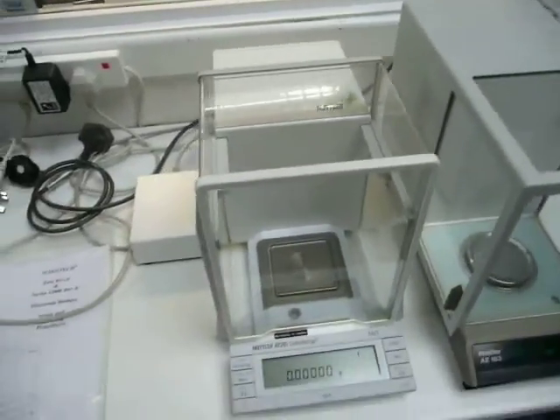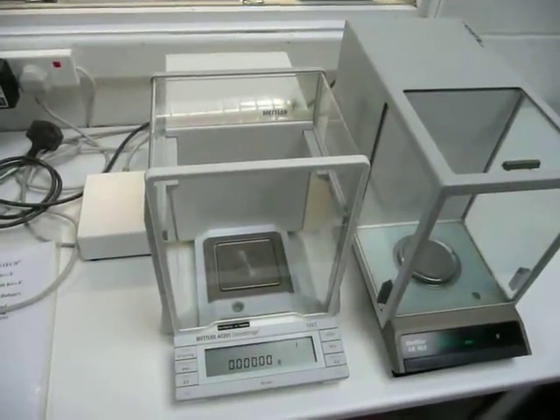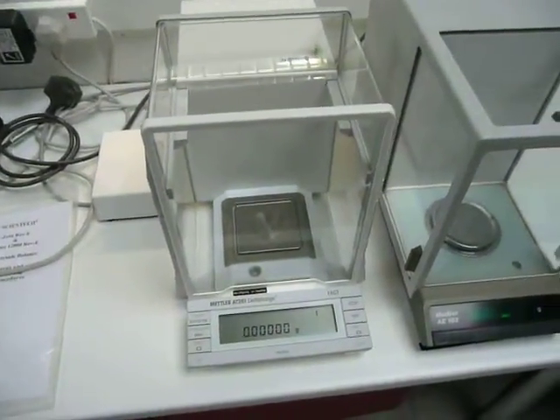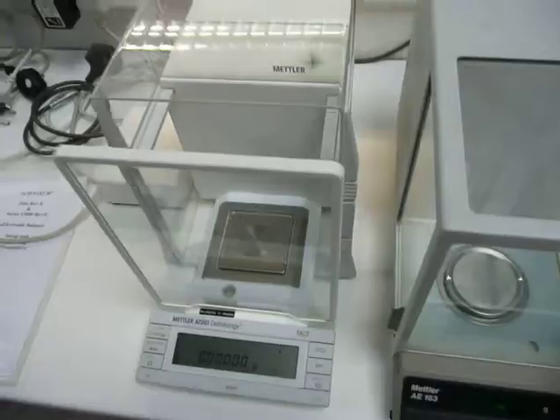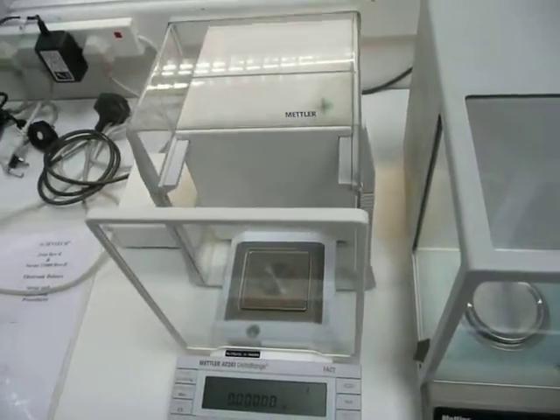We've then got a Metlar AT261 which is 4 and 5 decimal place, showing here 5 decimal places up to 261 grams. So it's a dual range balance, really nice balance with an electronic carriage there which is quite smart.